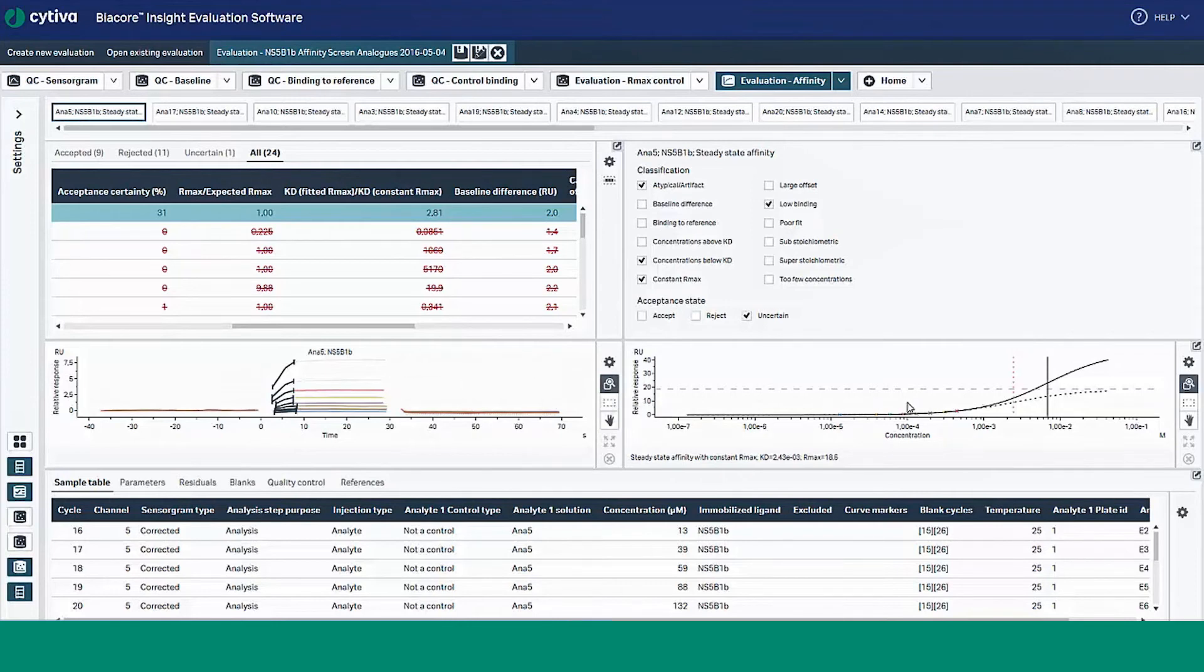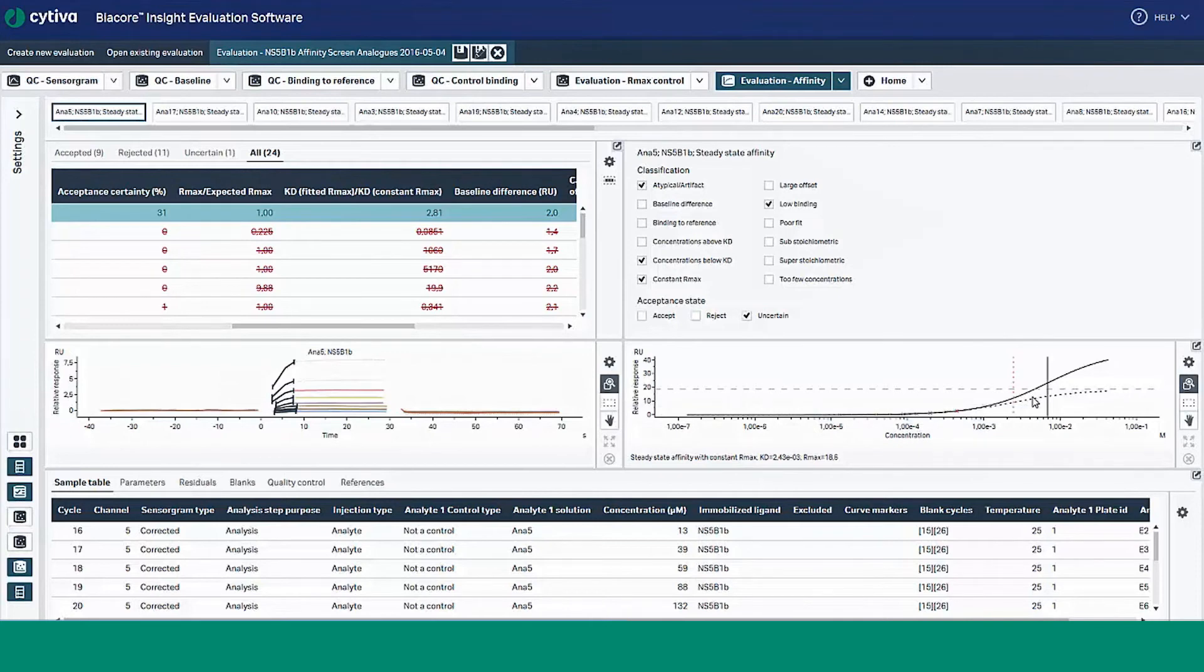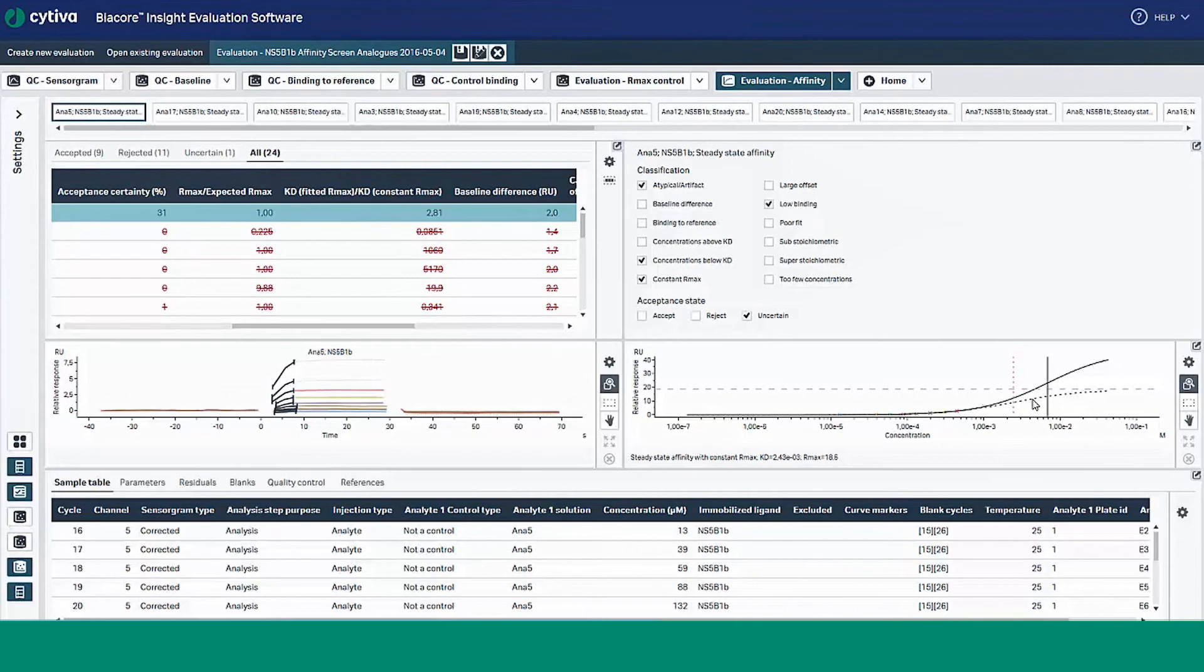Now, if we look in the right hand corner to see a plot of the relative response versus concentration isotherms. This includes two isotherms. The first one is the solid black isotherm, which is a plot of relative response versus concentration with steady state affinity model applied with a fitted RMAX. The solid vertical line denotes the KD determined from the fitted RMAX.